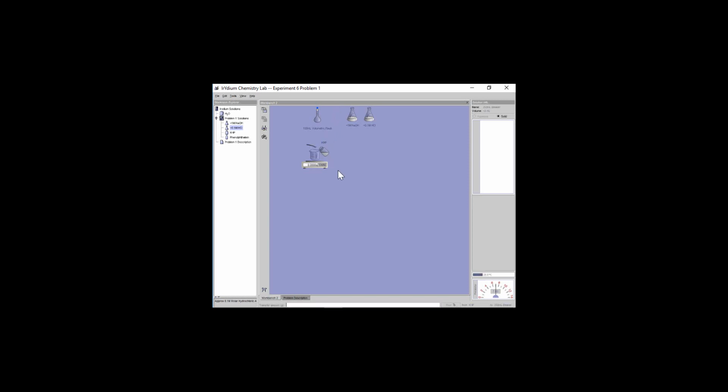For me to transfer KHP, I'm going to start with the KHP. I'm going to drag it over the beaker. On the bottom here, I have a nice transfer bar. I can actually type in the number, the mass that I want to transfer. I calculated if I want to make 100 mils of my standard solution, I want to toss in 18.38 grams. You can either press enter or you can press pour. As I pour that in there, the scale should read, oh, perfect, 18.38. You might be a little bit off. Maybe I calculated 18.38 and we got 18.40. Just change your number to 18.40 when you do your calculations. That was an approximate anyways.